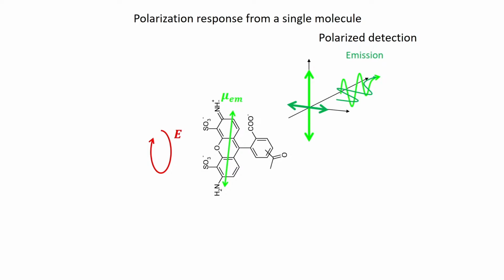The only drawback of looking at single molecules, of course, is that, especially for super resolution imaging, you cannot detect a single molecule for too long. So this is why we privileged here to measure orientations from single molecules, using emission polarized detection. So in a way, the idea here is to not anymore photoselect any absorption orientation.